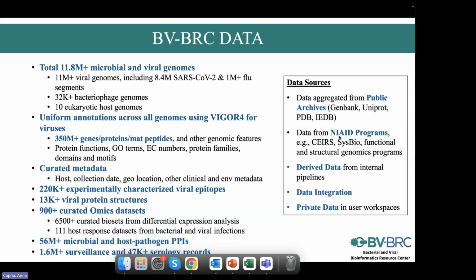I'm going to let Roshni talk a little bit about that, as that is relatively new. And if you were an IRD user, you might remember the sequence feature variant type data, but that is now on the BV-BRC ready for you to use.